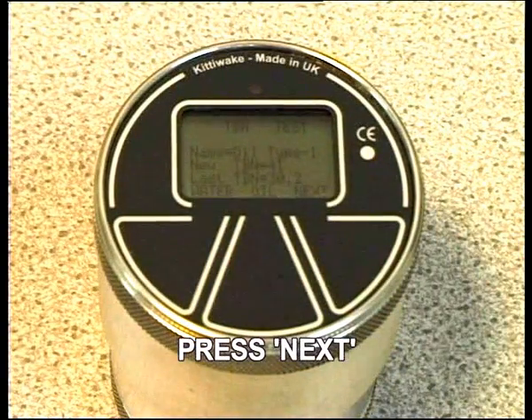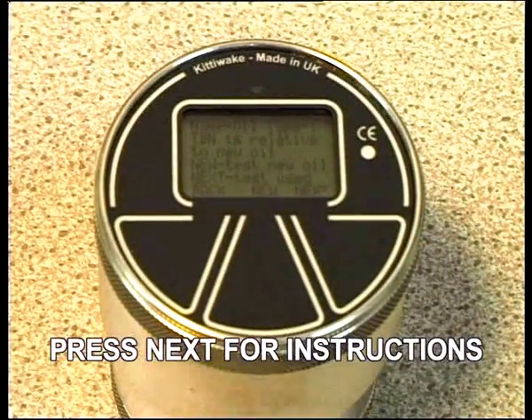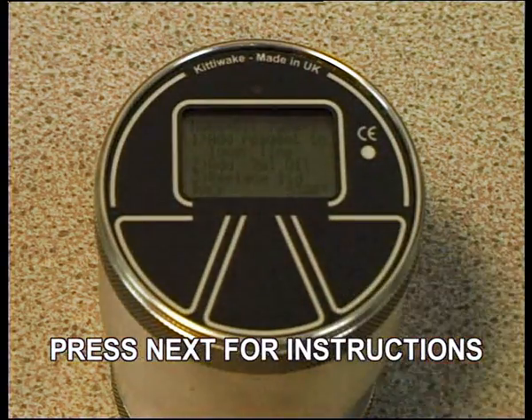Press Next to proceed with the test. Press Next again and follow the on-screen instructions.